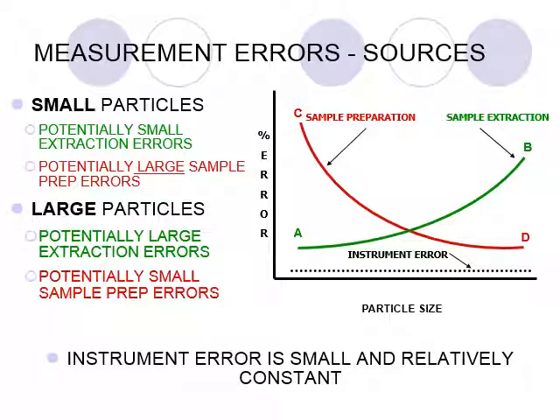This slide is somewhat the most important slide in this part of the talk. This goes back to what I said. The real key to doing a particle size measurement is understanding that the instrument error is small, pretty constant. The instrument does a good job. The key for making errors are in terms of the two things that you, and/or in my case, a customer, can control part of, and then I, as the person doing the test, control the rest of.